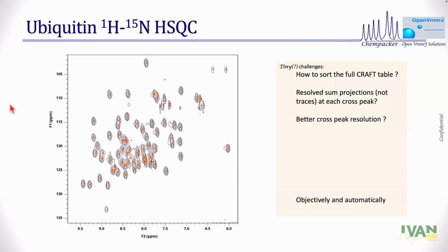Yeah, I don't want to do peak picking. Then that becomes another step for me. I just want higher resolution in there. How do I get higher resolution? So I can generate, quote unquote, projections of, let's say, these 4 peaks there, individual, independent of each other. Yeah, I want to have that. I want it all. So, better cross-peak resolution.